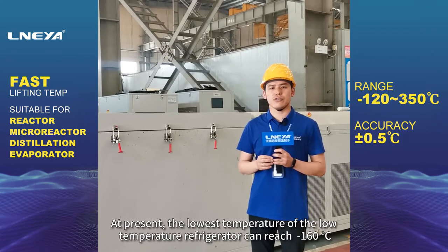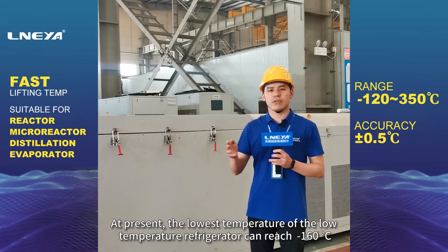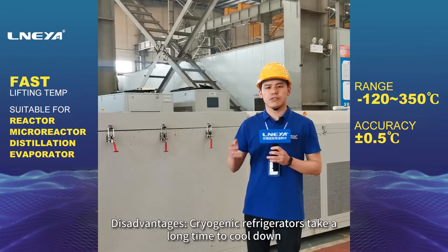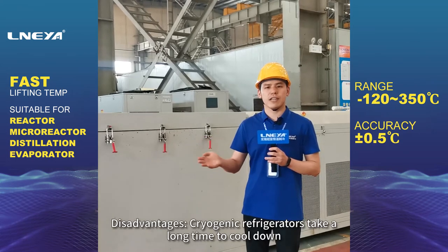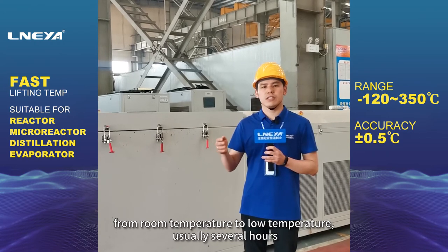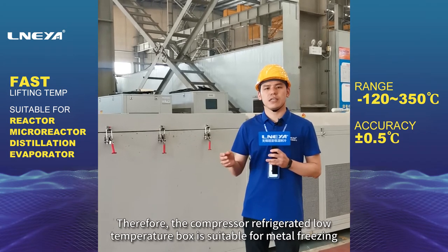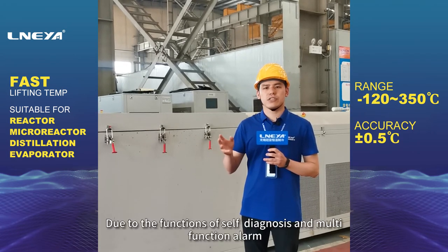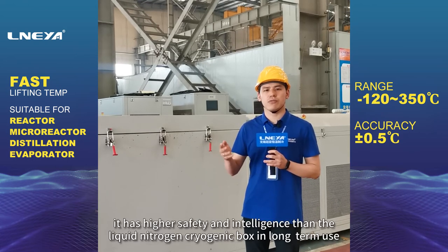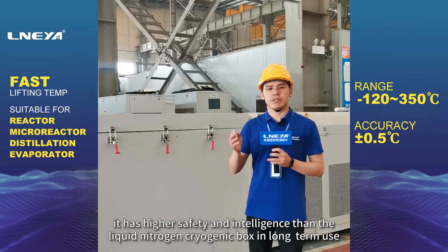At present, the lowest temperature of the low-temperature refrigerator produced can reach minus 160 degrees Celsius. A disadvantage is that cryogenic refrigerators take a long time to cool down from room temperature to low temperature, usually several hours. Therefore, the compressor refrigerated low-temperature box is suitable for metal freezing. Due to the functions of self-diagnosis and multi-function alarm, it has higher safety and intelligence than the liquid nitrogen cryogenic box in long-term use.